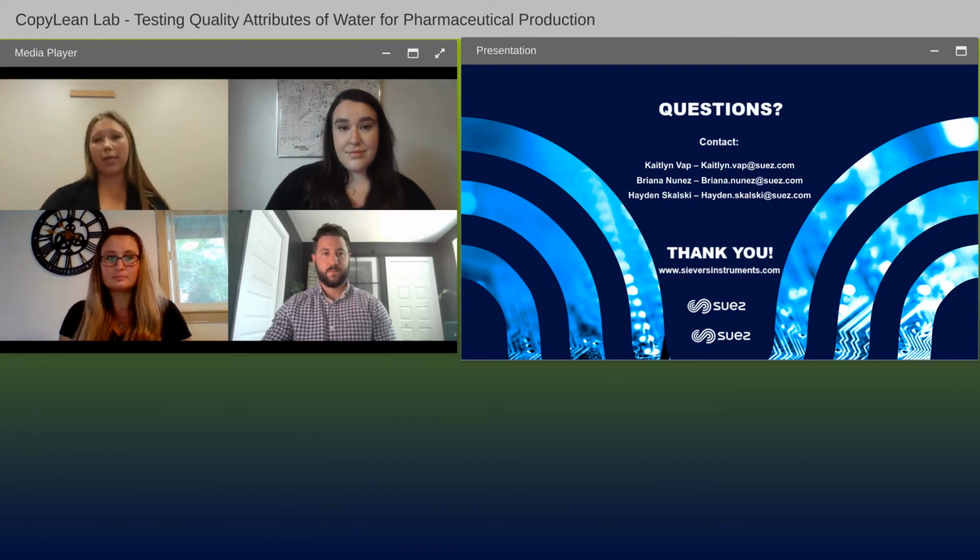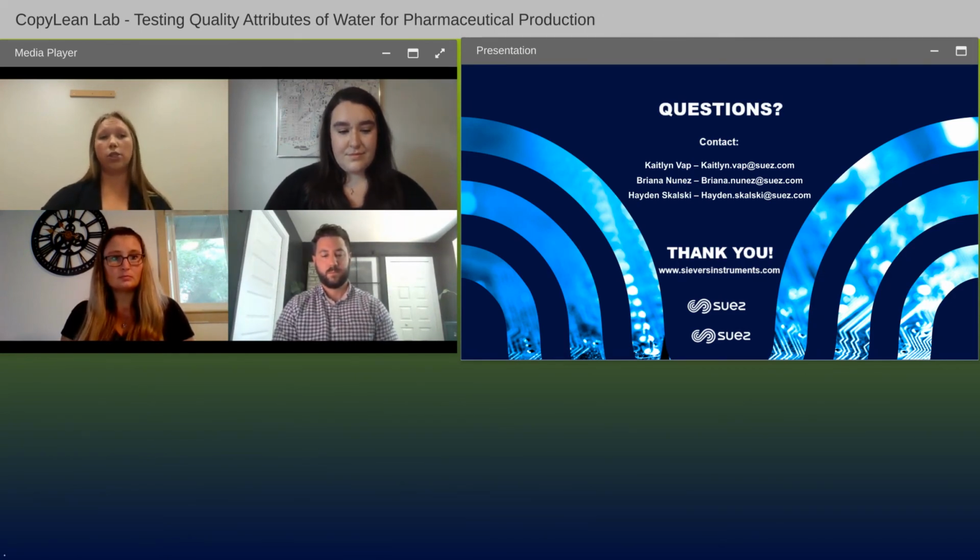And then ultimately, it's up to customers to determine which points of use are most critical to the process and drug product, whether that means a point of use that's commonly used for the manufacturing process, a point of use that's being used to dilute final drug product, whatever that might mean for you. There's a guidance document, IEC 60812, that can help guide you through the process of completing an FMEA.